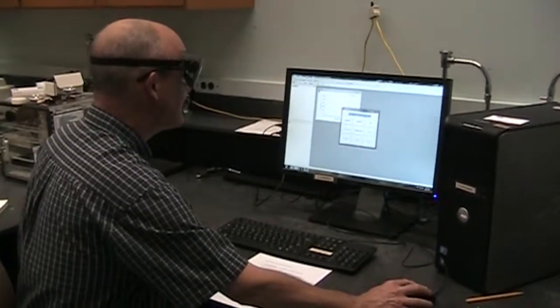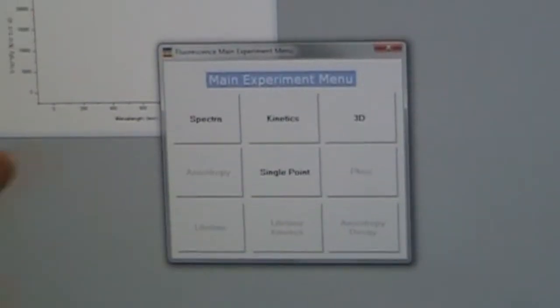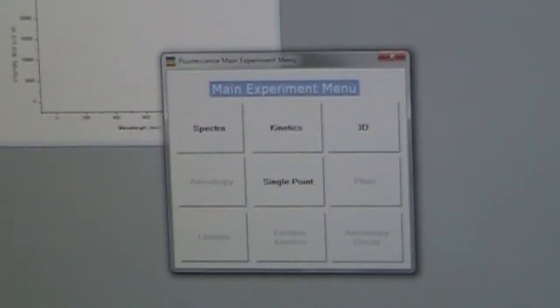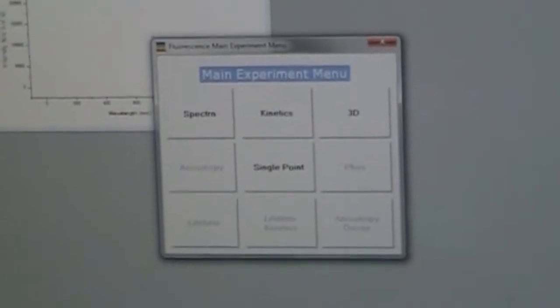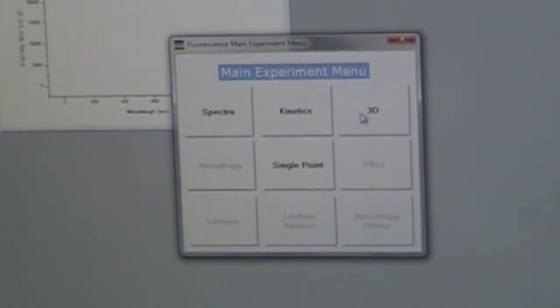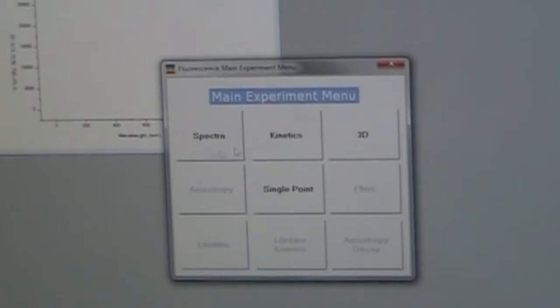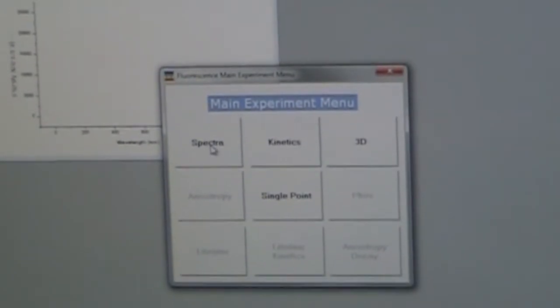And then we're going to be collecting spectra. So from this main experiment menu you can see there's options for other things like kinetics or three-dimensional spectra. We're going to go to the spectra page.